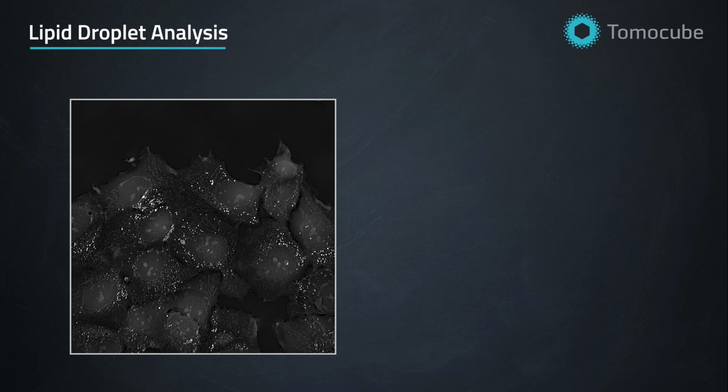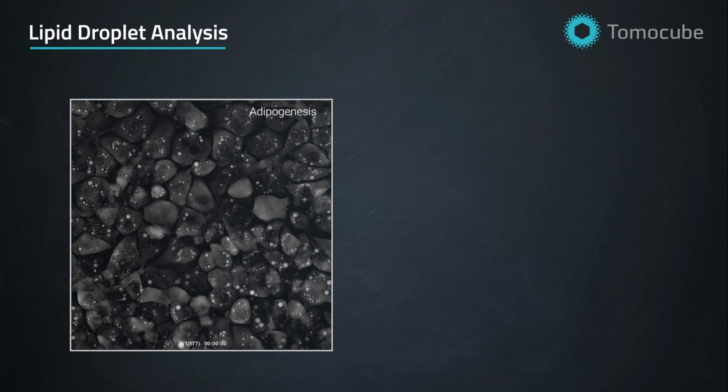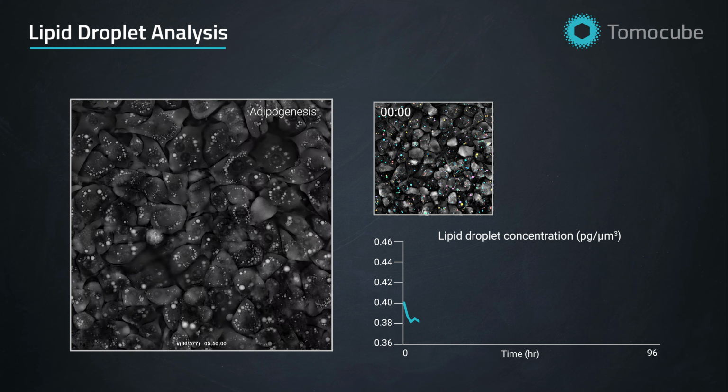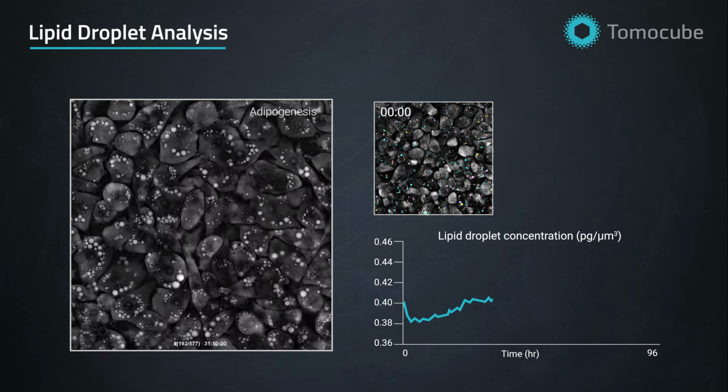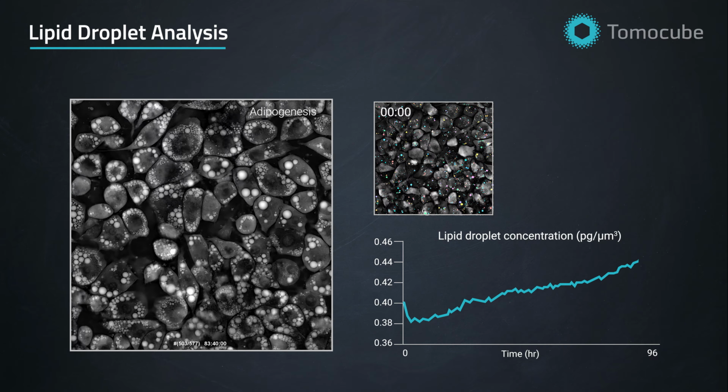Discover the dynamics of lipid droplets with TomoAnalysis. Leveraging lipid droplets' unique refractive index properties, our flexible analysis pipeline ensures precise detection and quantification, enabling the study of volume, concentration, and dynamic changes in adipocytes and beyond.